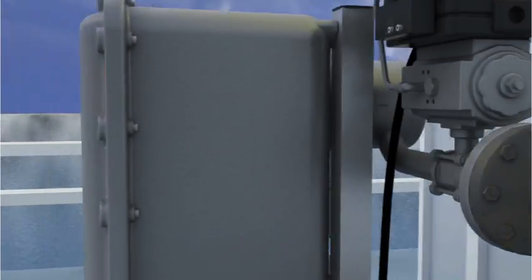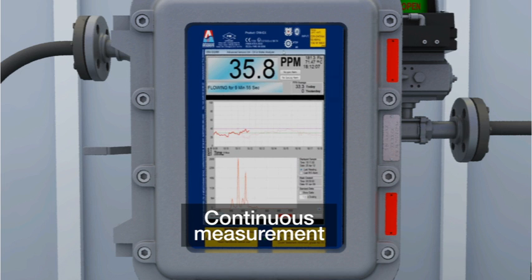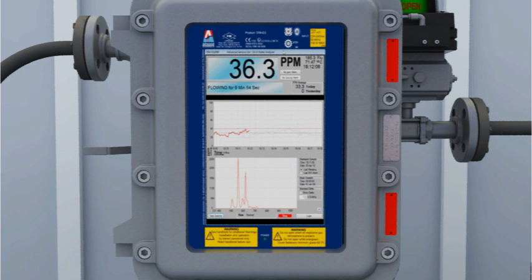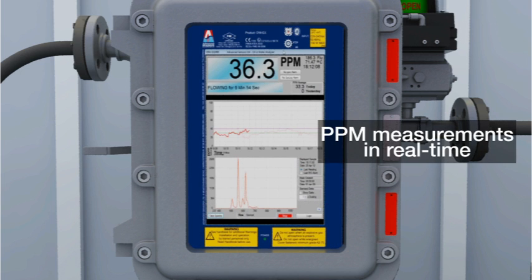The analyzer will provide continuous measurement and reporting of discharged PPM. Real-time PPM measurements are displayed, along with trending PPM, over a configurable timescale.